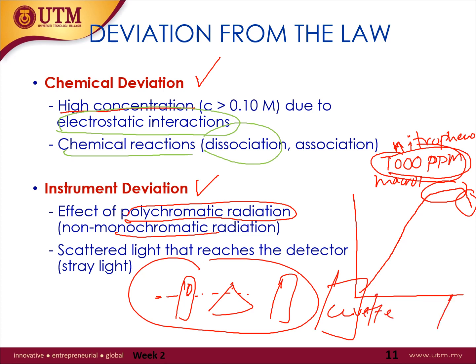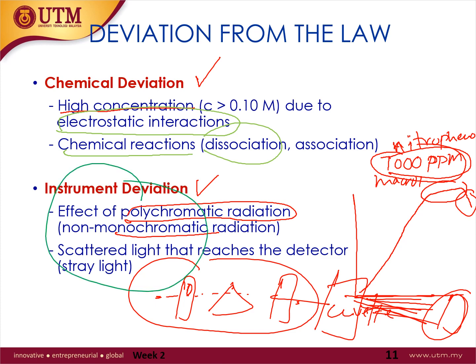Or it goes into the monochromator, but once it reaches the cuvette sample and then the detector, it strays. So it is difficult. Where should the detector detect? Here, here, or here? So the scattering happens inside the instrument as well. When this happens, it can usually be overcome only by manipulating the parts.